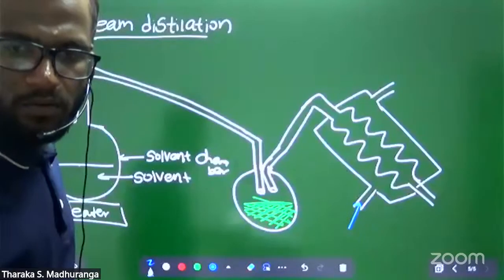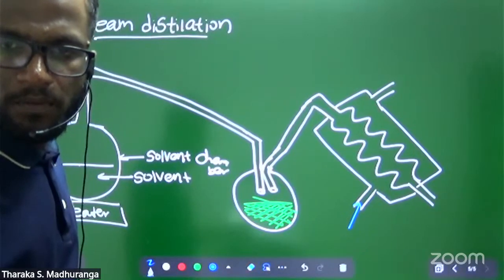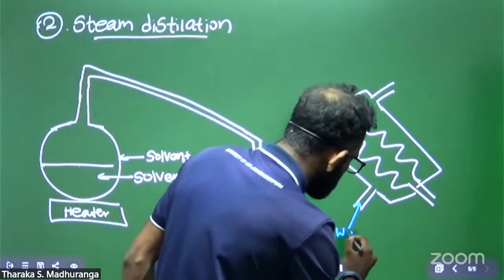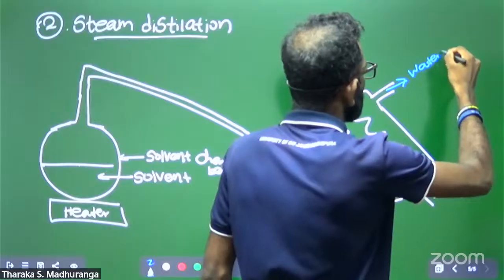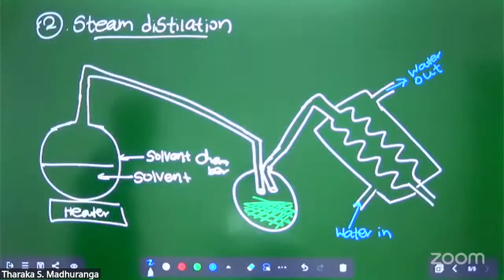This is water in. This is water out. Water in and water out.